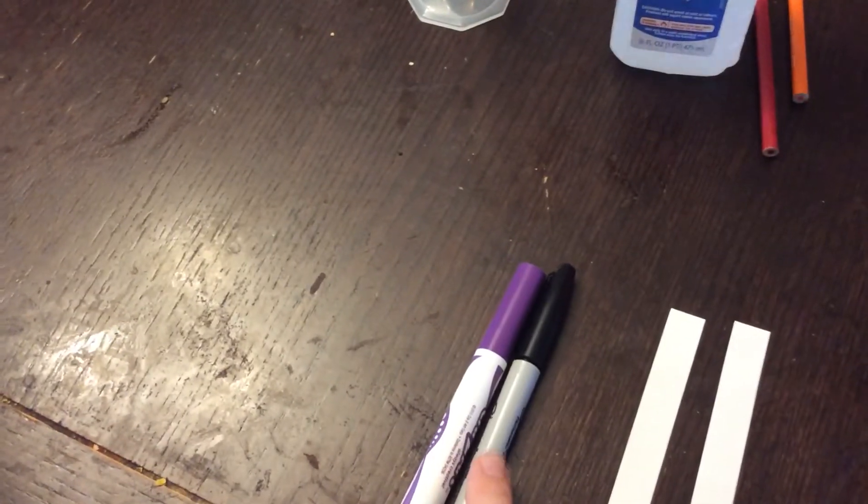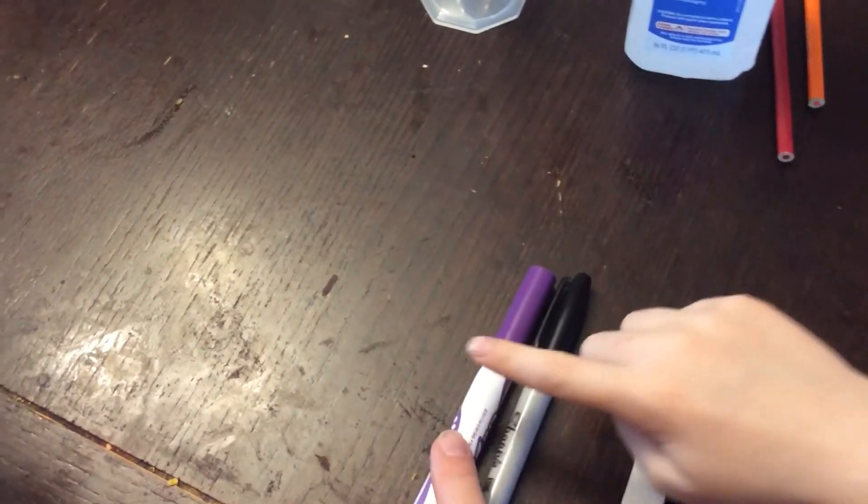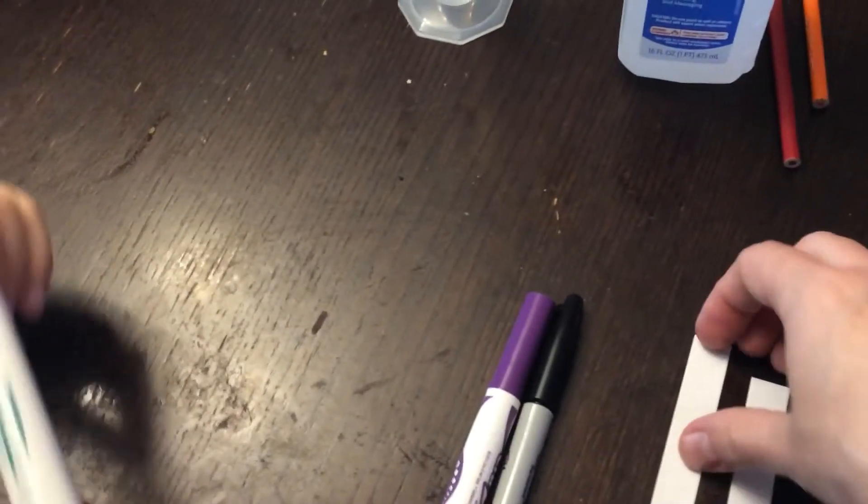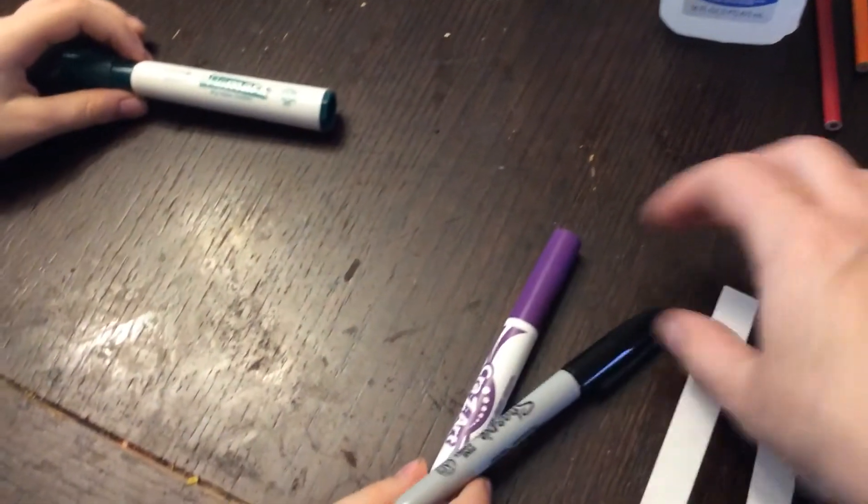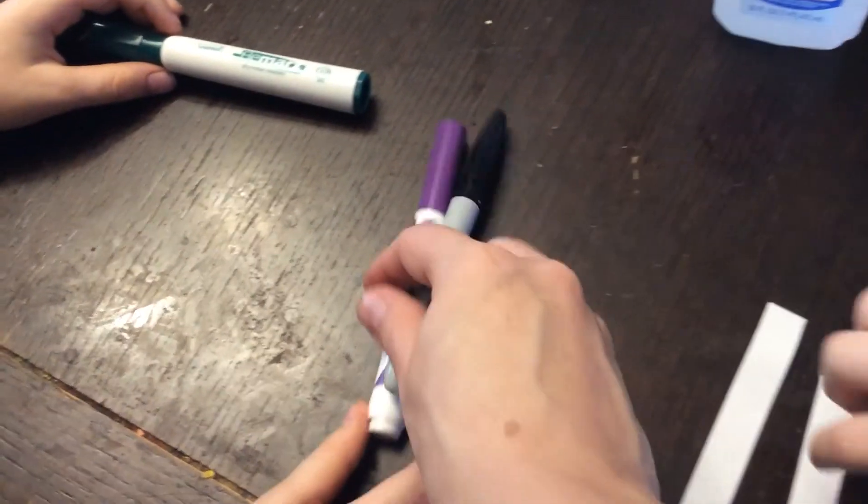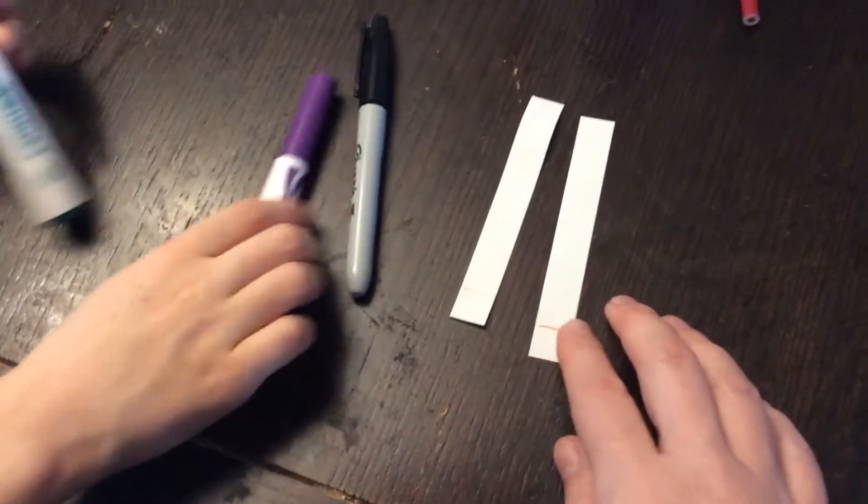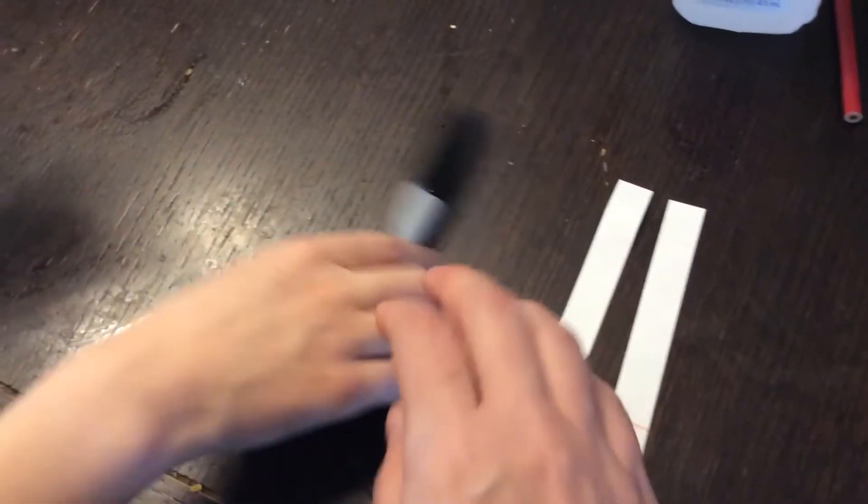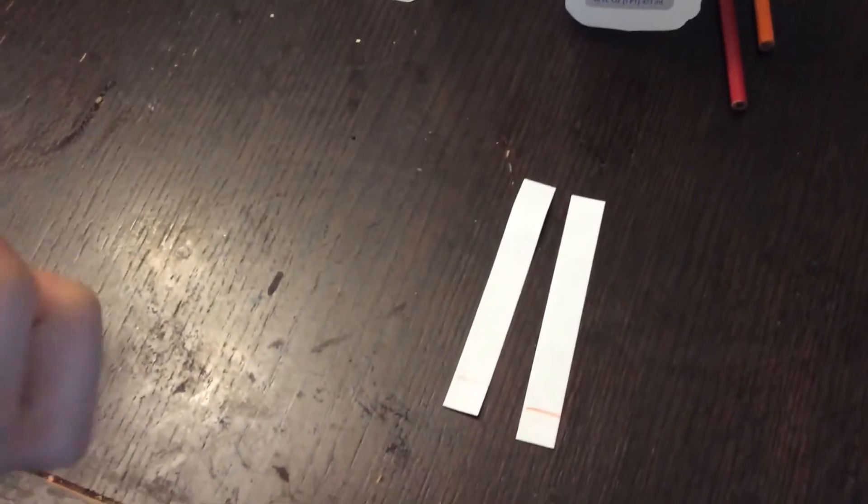So we're going to use black, purple, and green. We've got some chromatography paper here, and two are secondary colors and one is not a secondary color.